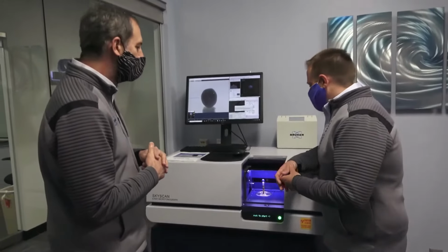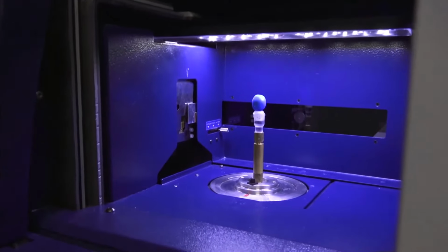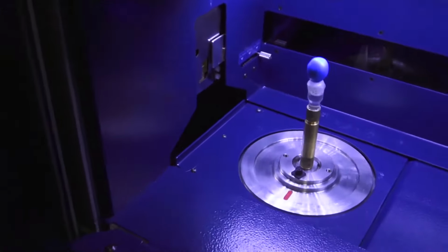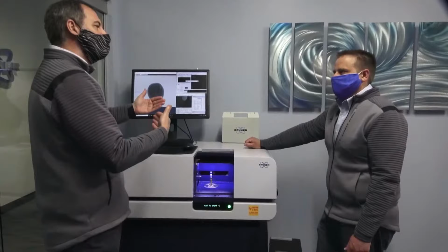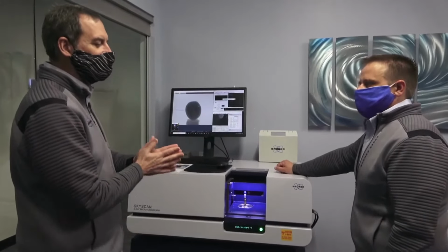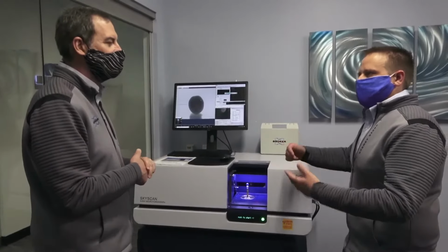Okay, and this instrument, it looks like we also have some sort of a little filter or something. Yeah. So on this system, it's a basic system, we do have the option of having an aluminum filter or a copper filter. And why would you use that? There's a couple of reasons, but typically if you're looking at a more dense material, you want to refine the energies up to the higher energies to get rid of some effects with the bremsstrahlung. Basically, you get a couple of material artifacts. It's easy to remove. Okay, so by limiting that radiation, you get a little bit cleaner picture in the end. Correct.